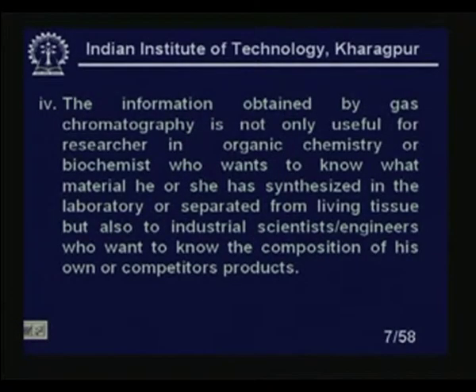It has tremendous application in industrial instrumentation, where we need to know the compositions of gases. It is a very important parameter in many situations, of one's own or competitor products, because suppose an unknown product is coming, we do not know the composition. With gas chromatography we know not only the percentage, but also the different gases present.